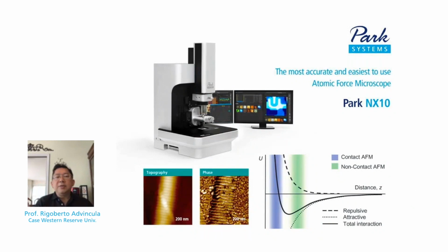The result, in a lot of the imaging methods that we have done and others as well, is that we get a very high resolution that contrasts the phase images better, and beyond that, of surface features that have deep trenches or patterns, we're able to get high resolution. So again, with this introduction on the Park, it hopefully complements what you've learned about QCM today.